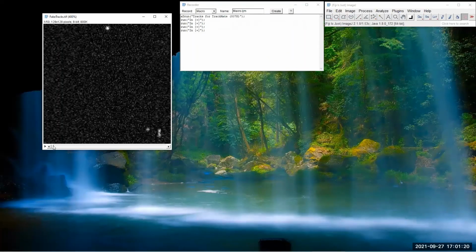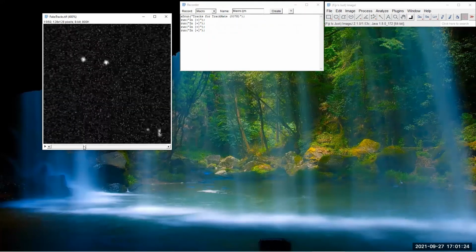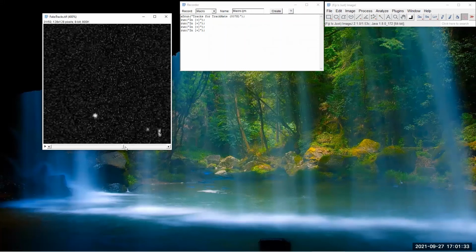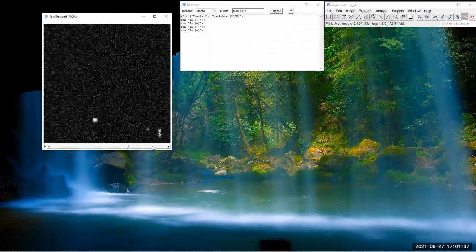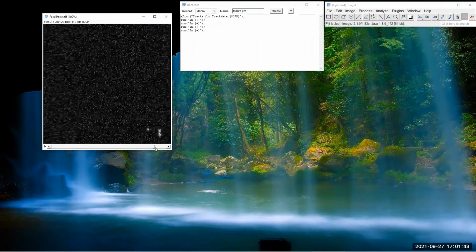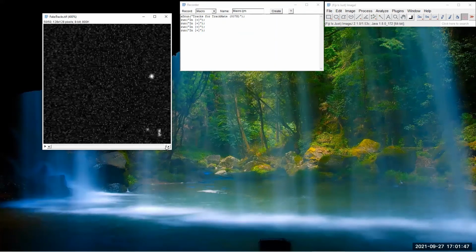Okay, so these are the images. You can see that some of the particles move over time, and a few of them actually split and merge into either more particles or into one more particle. As you can see, the particles here also disappear at certain frames. Like here, it disappears and it merges later on.